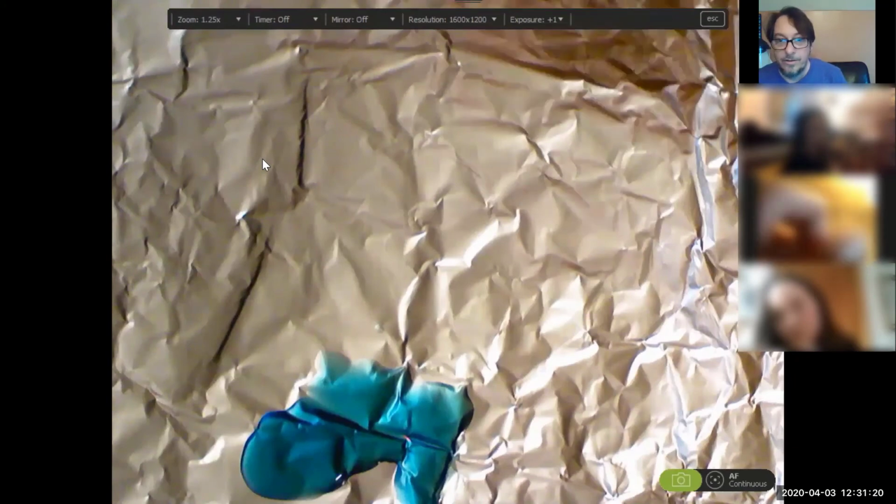All right, so we have that. And I am going to put down a nice puddle of our water here. Let me zoom out a touch. There it is.